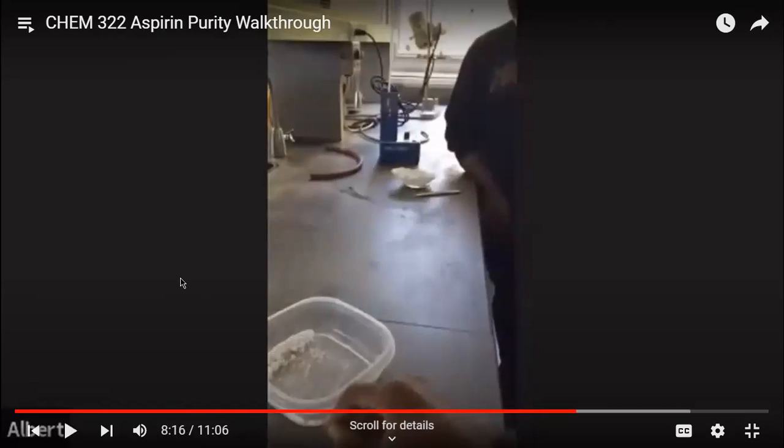With the capillary tubes, you want about a half centimeter of sample in there, because when you put that capillary into the melt temp, you need to be able to see your sample. So you don't want it too little, or it melts before you can even see it, like what's happening.